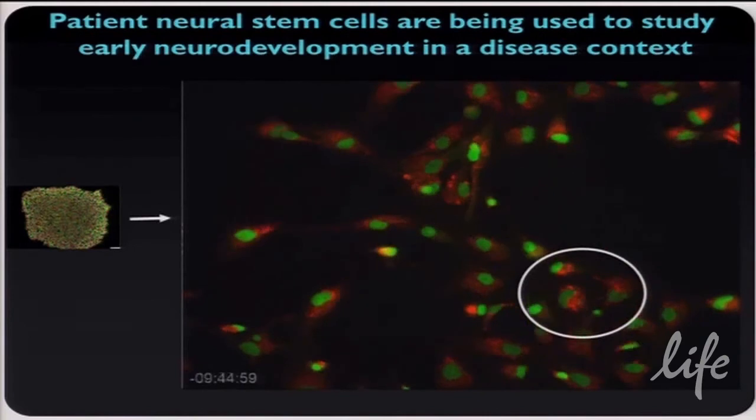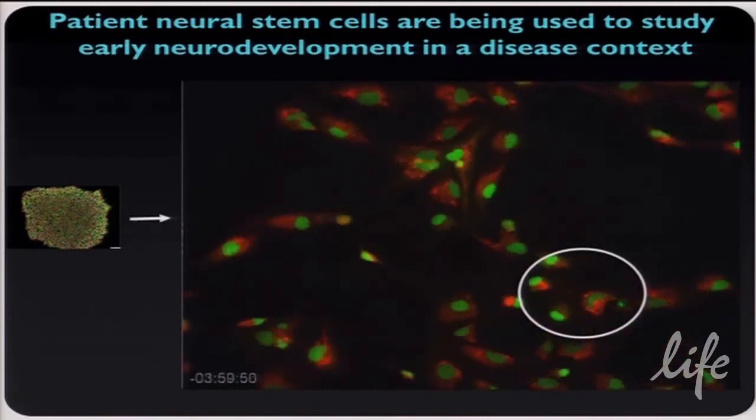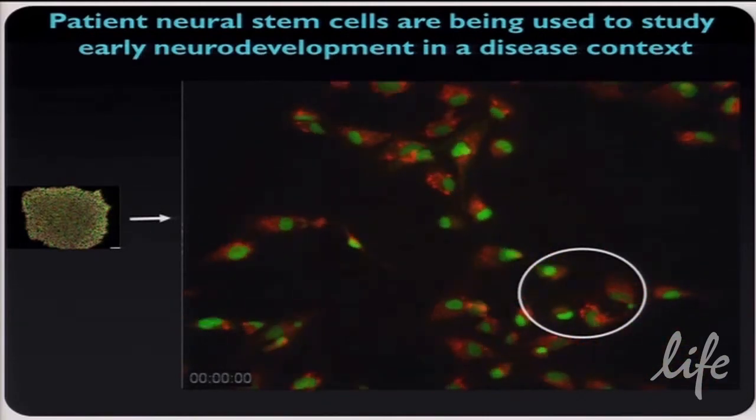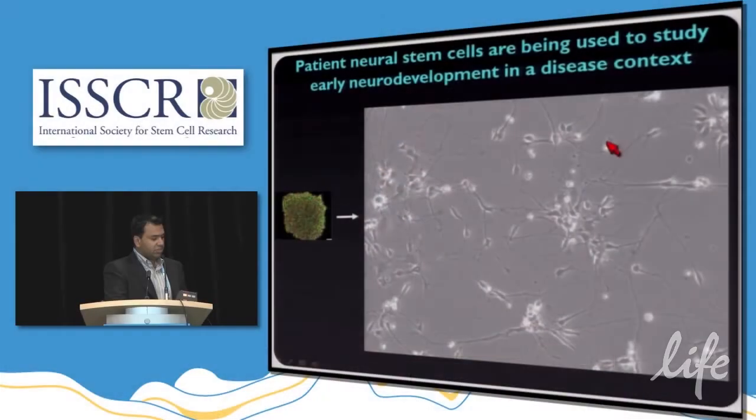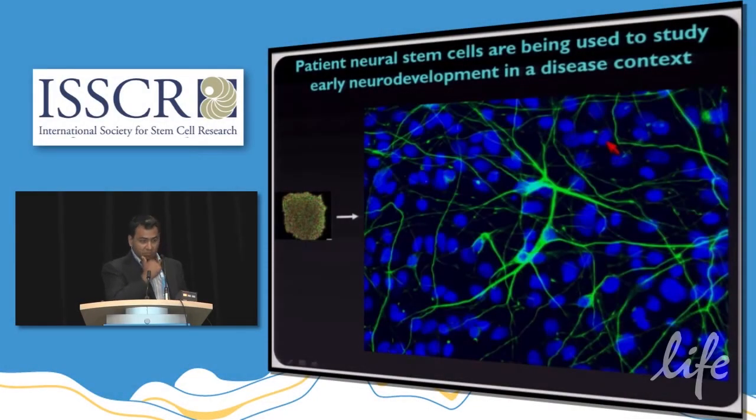So this is a disease I'm interested in. There's mitochondrial deficits. And once that happens, we take them into certain type of neurons. So in this case, these are motor neurons that are made using caudalizing and ventralizing these neural stem cells. And then eventually we stain and characterize them for the correct markers of motor neurons. So this is SMI32, or neurofilament heavy, that's a motor neuron marker.